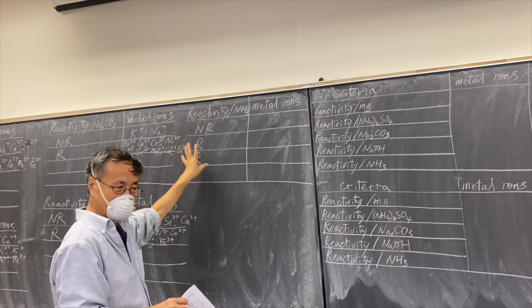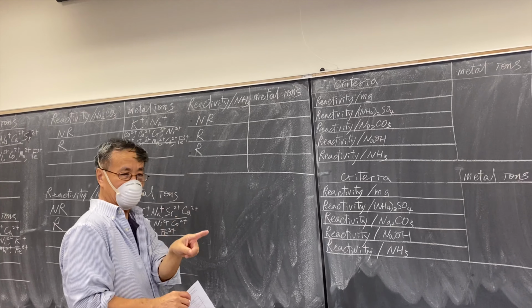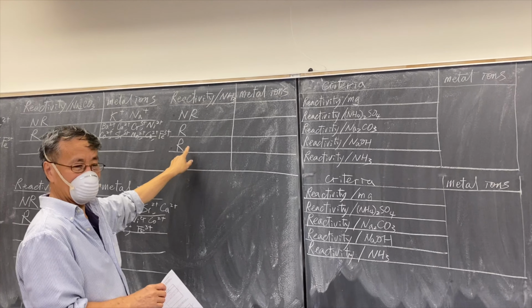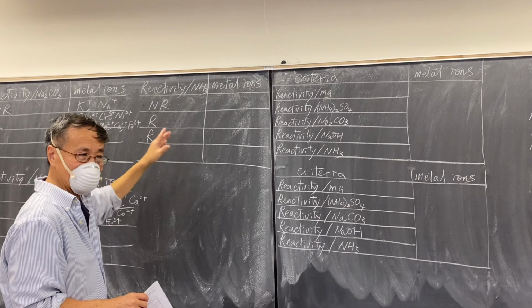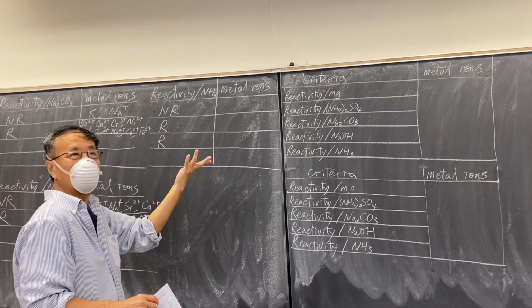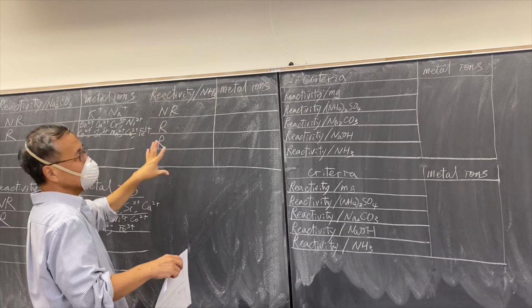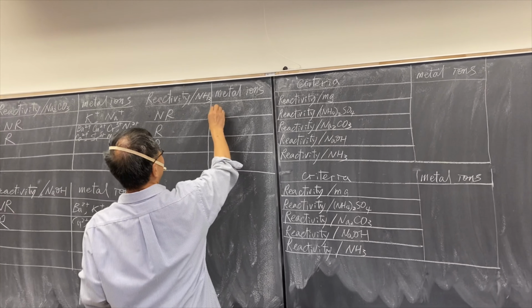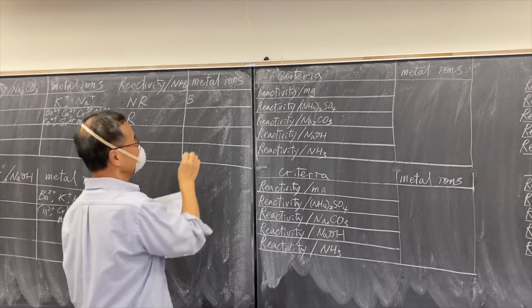One type of reaction is a color change of the solution only. The second one is not only the color of the solution changing, but also the reaction generates a precipitate. So we're going to do that, make our life a little more interesting, or harder.